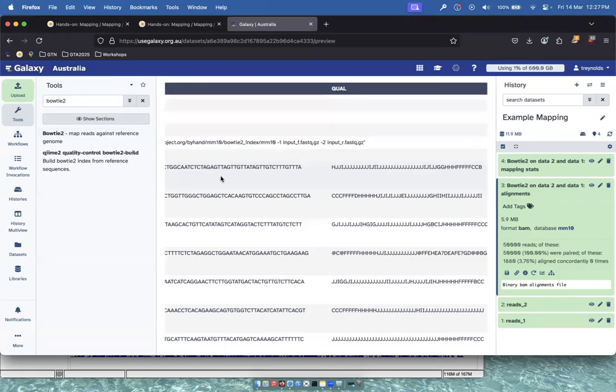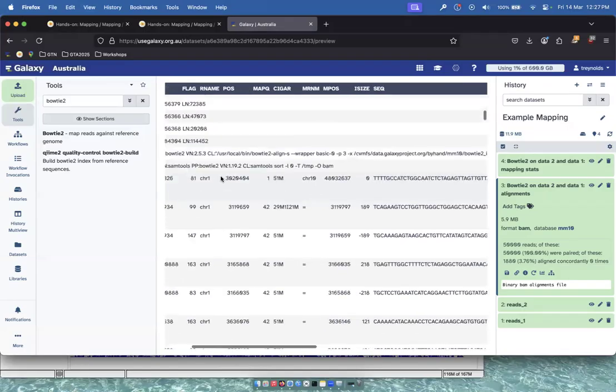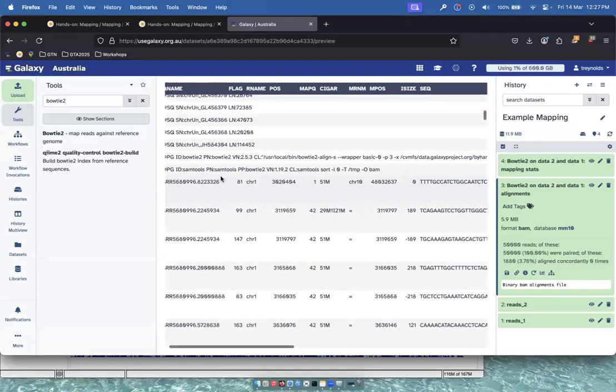And the main difference between this and the original FastQ input files is the BAM file now contains mapping information such as the location of the read on the chromosome, mapping quality, and the other parameters that we just discussed. Now, this provides the quality of the mapping within a table. And what we now want to do is summarize these mapping statistics. So we'll use another tool.